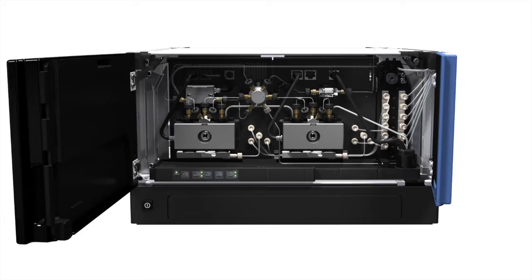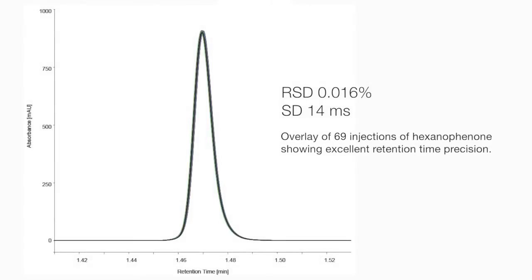From ultra-fast to extremely shallow gradients, the Vanquish UHPLC system always provides unmatched retention time, reproducibility, and the lowest baseline noise.